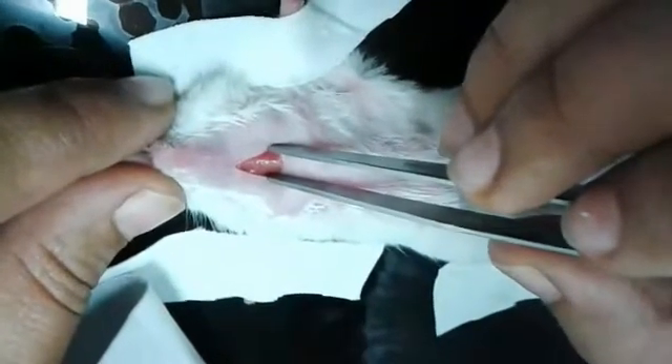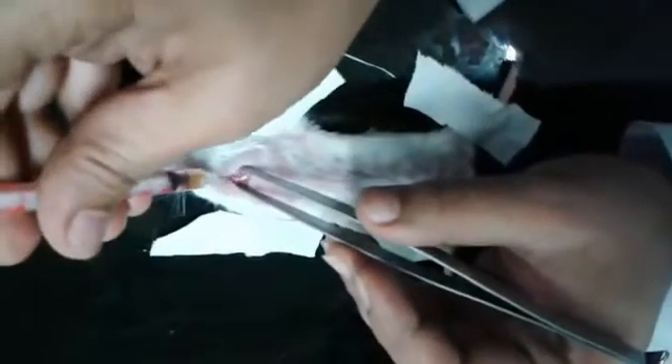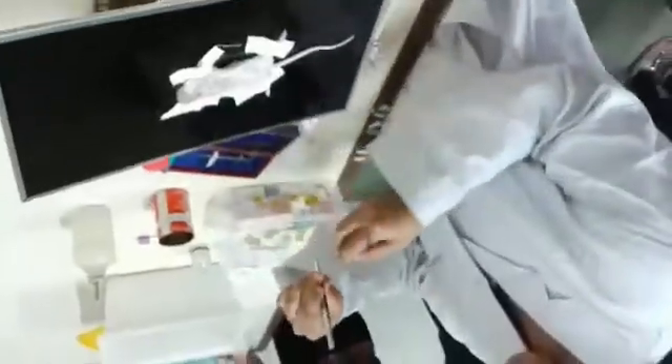Here you can see the trachea is visible now. Next, you need to load your injection with the sample. Then, with the help of a forcep and a syringe, inject your sample directly into the trachea of the animal model, but inject slowly.